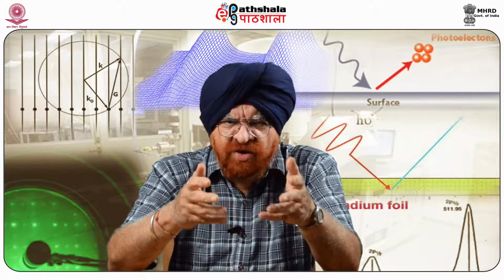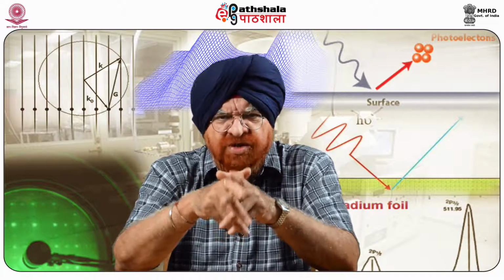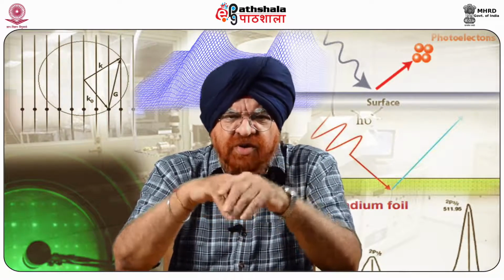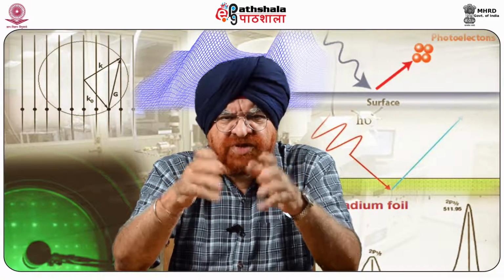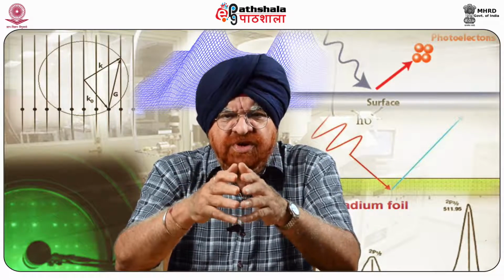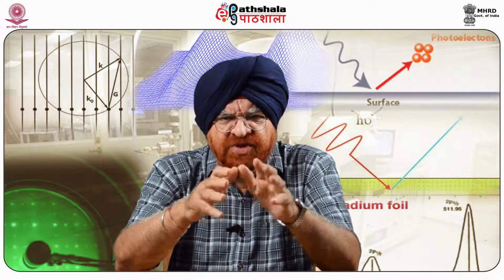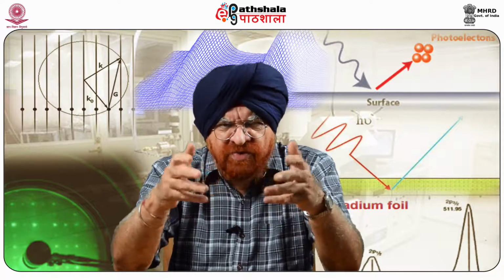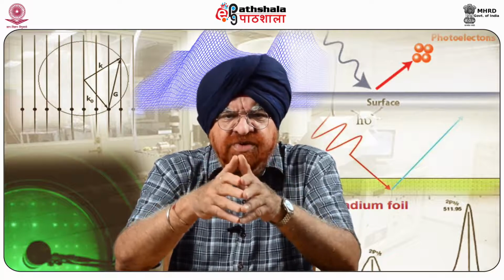as I said, there are a lot of disadvantages when we use this, particularly for biological systems. We talk about the limitations or disadvantages of STM. Making atomically sharp tips remains something of a dark art. That means something which is not that easy. Still, one finds it very difficult to make sharp tips.